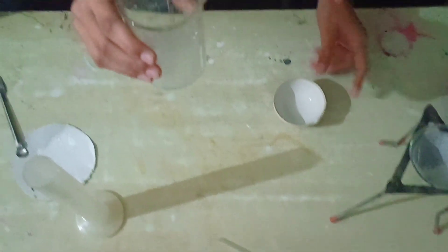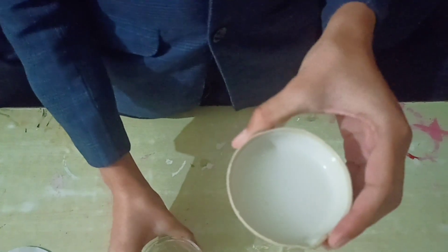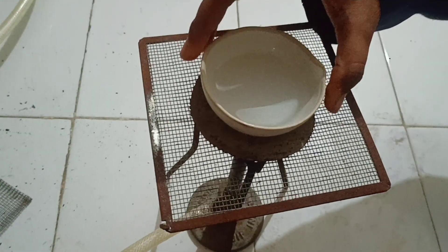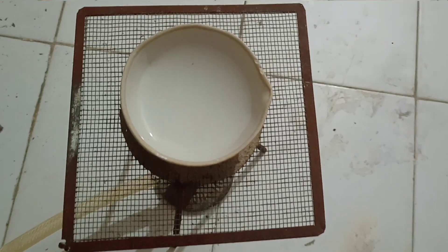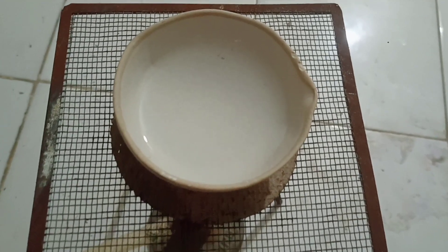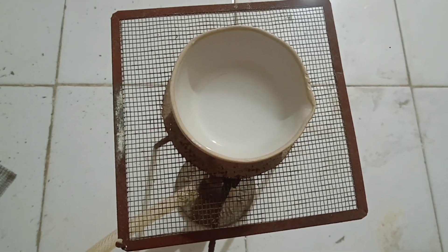This is the filtrate. Transfer it to the china dish and heat it till the crystallization point. Now we have to heat the solution on this burner till the crystallization point. Heat the solution till it reduces to one-third. We will heat it for 20 to 25 minutes.